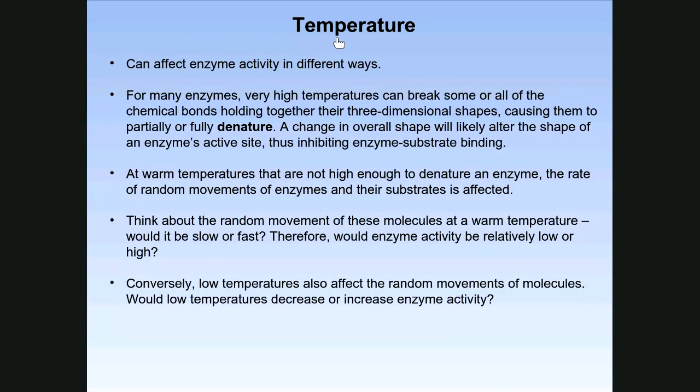Okay, with temperature, the enzyme I said you're working with today is commonly found in our cells. That means it prefers a temperature of 37 degrees Celsius. That is the optimal temp for the enzyme. But keep in mind, I said this in lecture for chapter 8. The optimal temp for an enzyme doesn't mean that's the greatest amount of product the enzyme can produce.